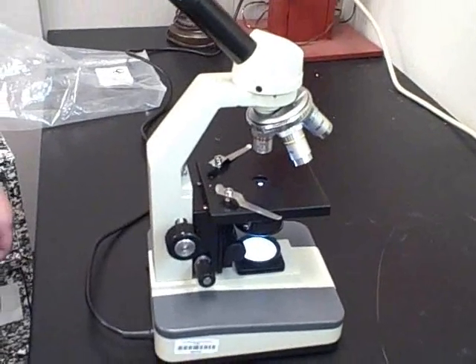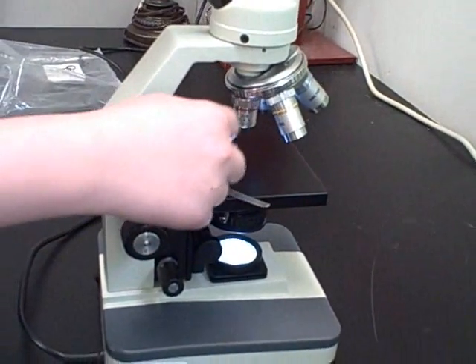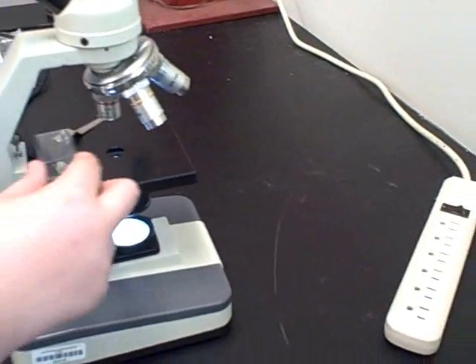The next thing you do is make sure that your microscope is on low power. Then put the slide onto the stage.